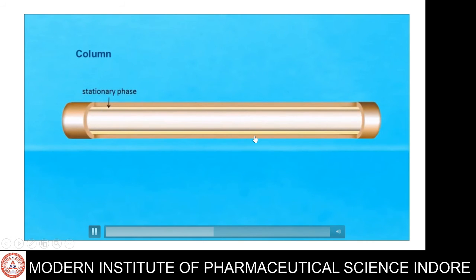Components of a mixture are separated based on their ability to absorb or bind to stationary phase. A component that absorbs most strongly to the stationary phase stays in the column for the longest time and will therefore have the longest retention time. It will emerge from the gas chromatograph last.